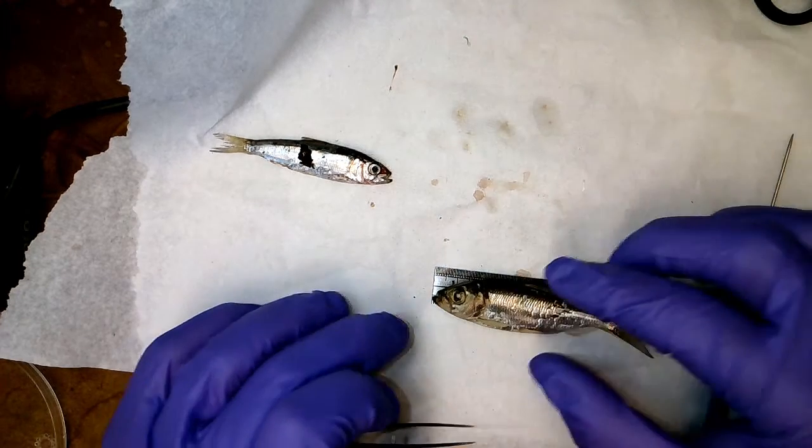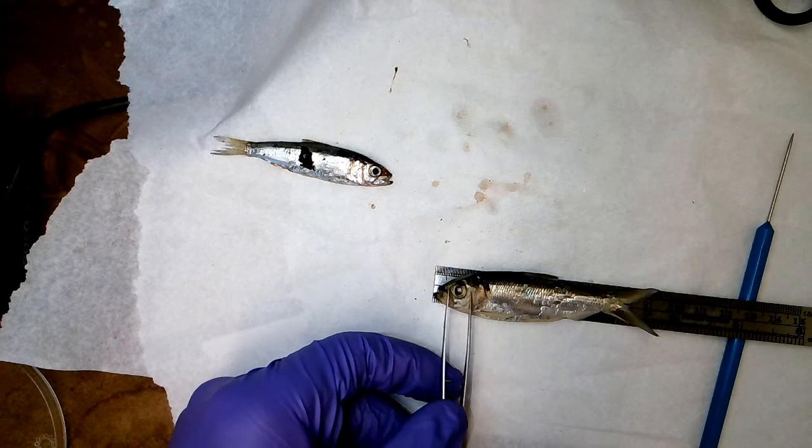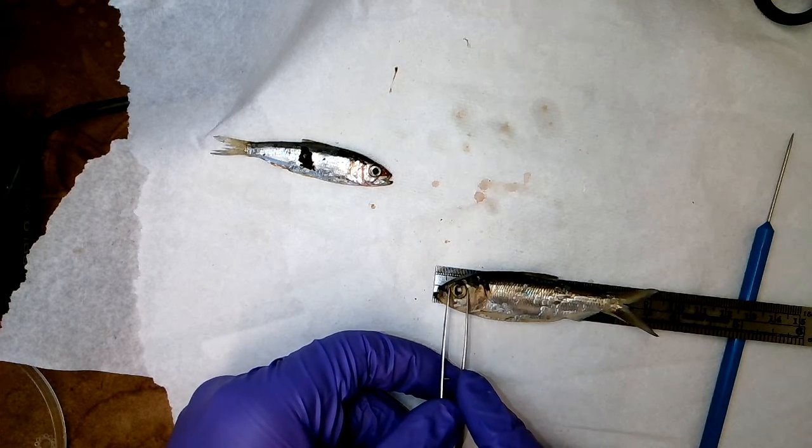Okay, now let's move to measuring the diameter of the eye. Again, that's this width right here.